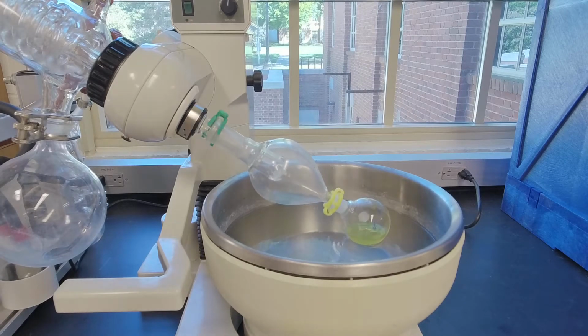But the solvent is going to evaporate. How do I sound when you're watching this at like 2 times speed?